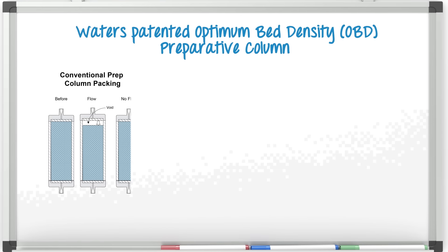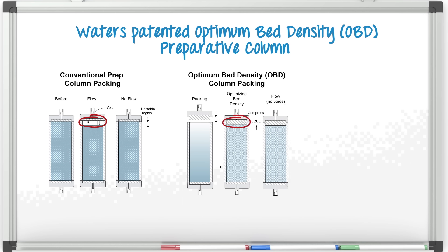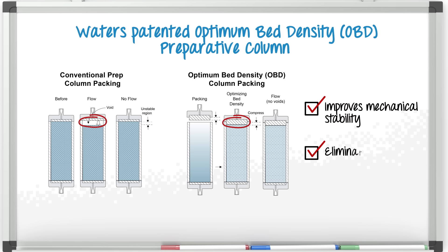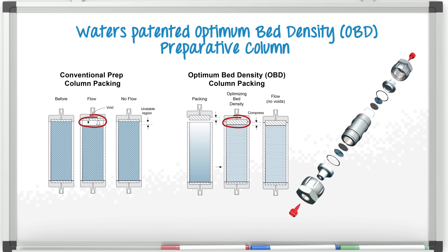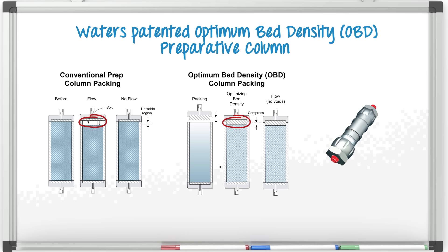Conventional prep column packing can form voids. Optimum bed density, or OBD, column packing was designed to eliminate voids, improving the mechanical stability of the chromatographic bed, particularly at the inlet of the column, and can eliminate column failure. In this diagram, you're looking at an expanded view of the Waters' patented optimum bed density, or OBD, preparative column.